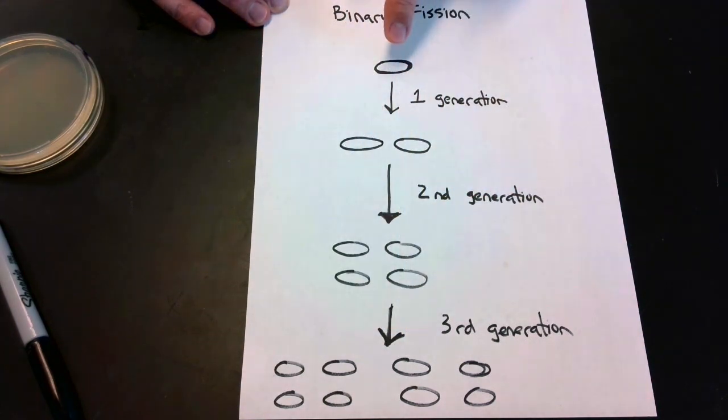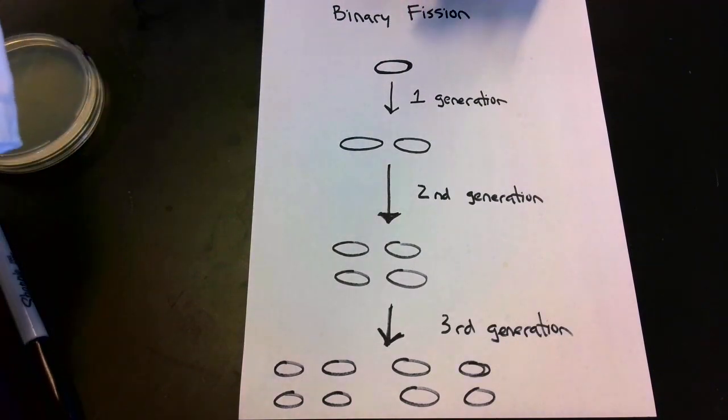So in this way, when microbes grow on a solid medium in the laboratory, if we start with one bacterium, it will eventually grow to a large enough population to form a collection of bacteria, and those collections of bacteria are what we call colonies.